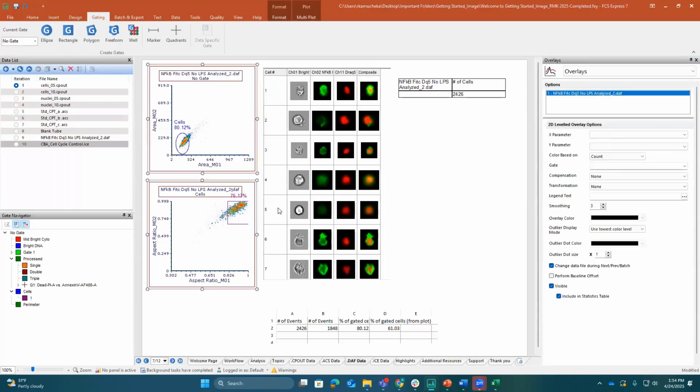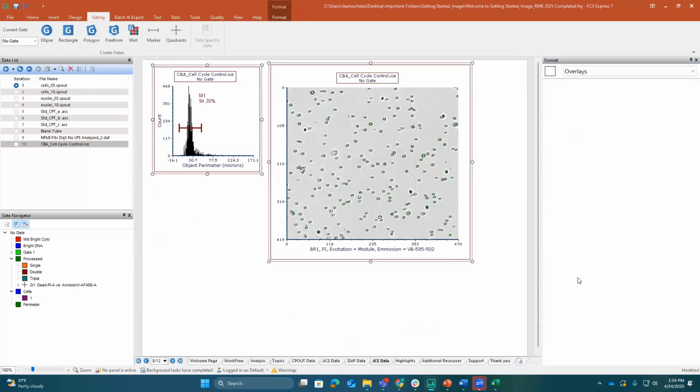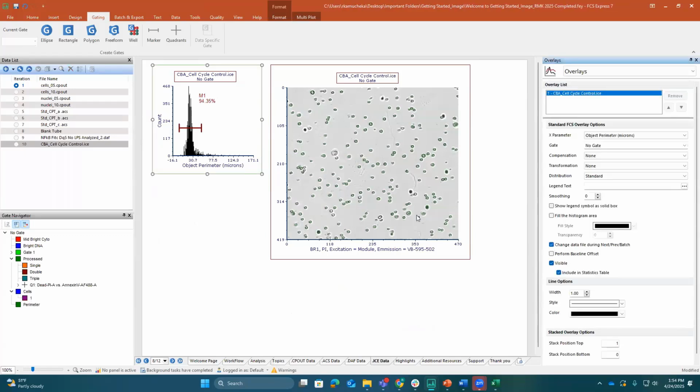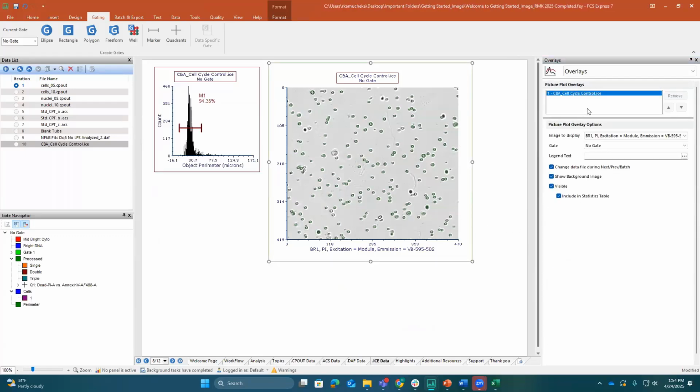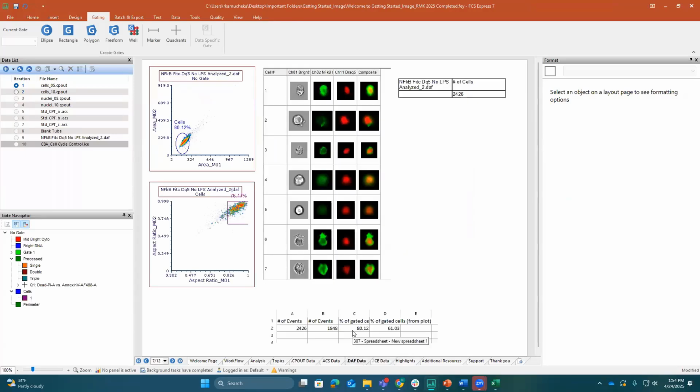Let me go over here, one at a time. Now, if you do deactivate this option to change the data file, when I load new data, it won't load automatically. There will be some other little caveats there about using the data.